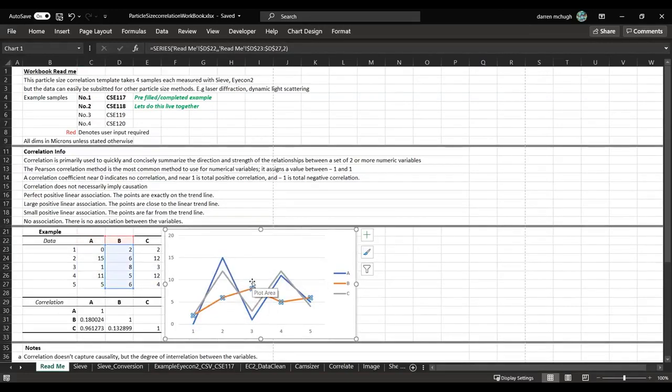What we can do once we have all the data populated is a correlation analysis in Excel. I suppose this is a good point to mention, this doesn't have to be done in Excel. It's whatever package you're familiar with. Maybe you have a preference in your company, such as MATLAB or R, or along those lines. But I'm familiar with Excel, and it allows me to break down the analysis a lot more to the fundamental levels like this. So the first formula is just CORREL, if we can see that up here.